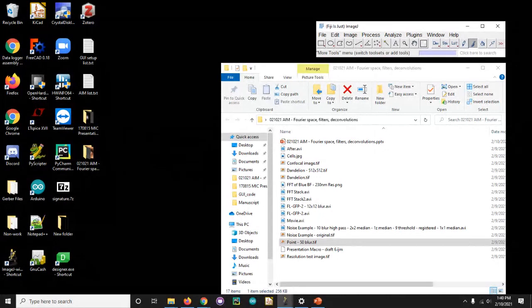And also should get into that. What I was hoping to get across now is that you really want to read up on the papers that involve these deconvolutions, because it's almost always going to involve some degree of modeling of the point spread function. You can directly extract it, but sometimes a little bit of fitting helps nudge a little bit further, and it helps to know what the algorithms are that are being used.